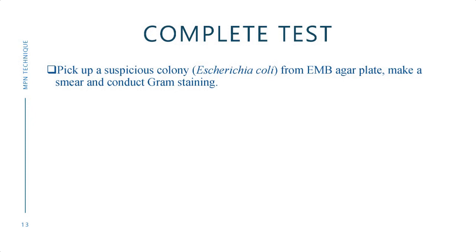So, for the completed test, take a colony from EMB agar and make a smear on a slide for gram staining. This is the procedure and method of the MPN test.